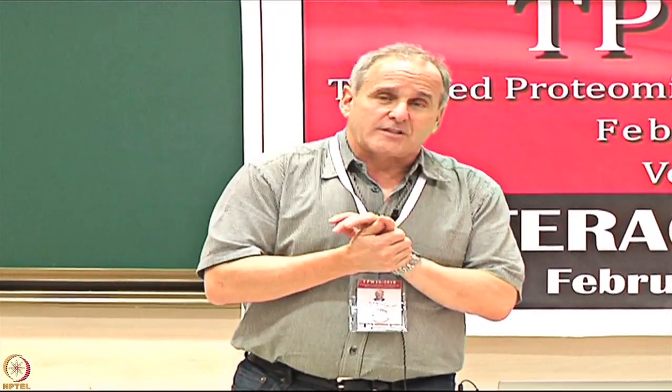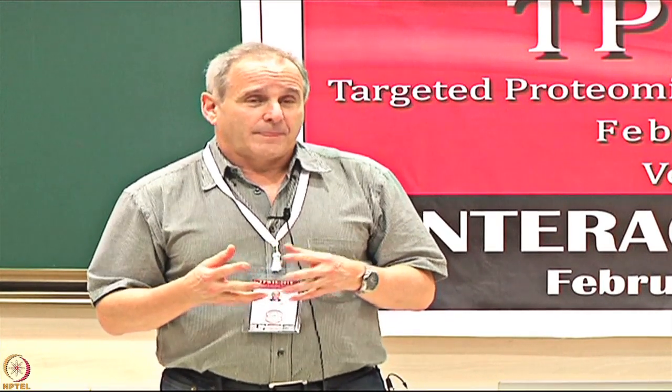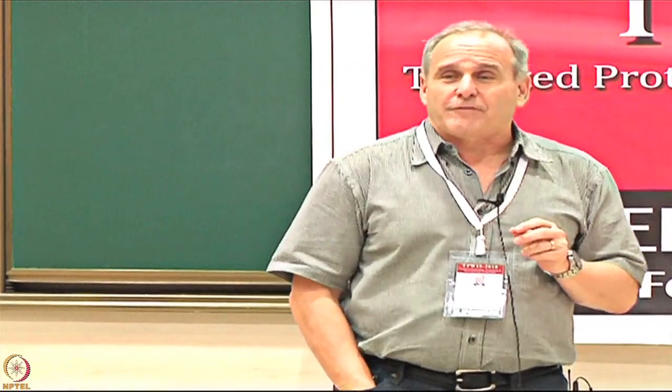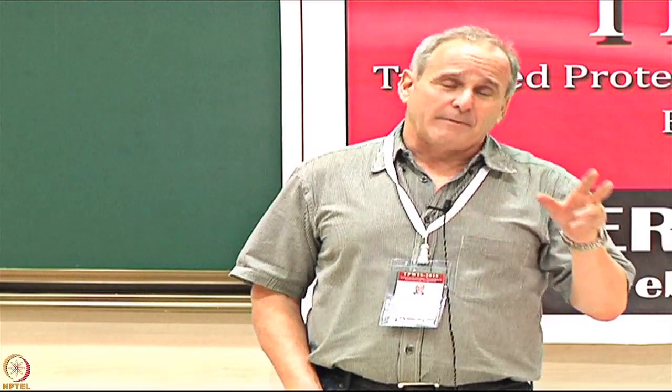So when we begin these studies, we're going to study these days in my lab maybe 15,000 different proteins. That's a pretty good list. Now, attached to that list is a price tag, right? Because by definition, even using NAPPA to get 15,000 proteins on a slide, we have to do 15,000 DNA mini preps. And that's a lot of DNA mini preps. It's certainly easier to do mini preps than it is to make protein, but it's still a lot of mini preps. And even if the mini preps were $2 or $3 American dollars per mini prep, to do that many mini preps is nearly $50,000, right? Just to do that number, not to mention the labor and all the time involved in preparing it.